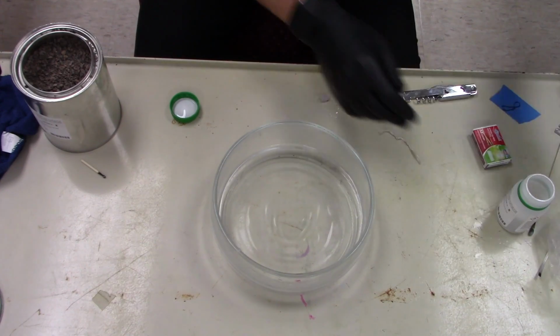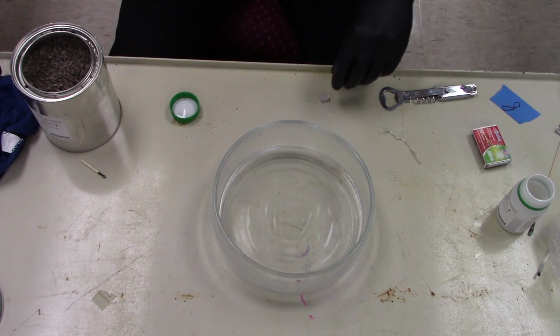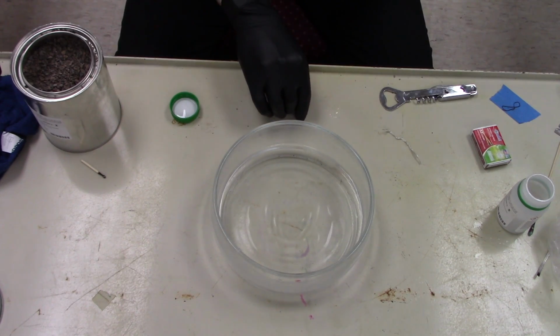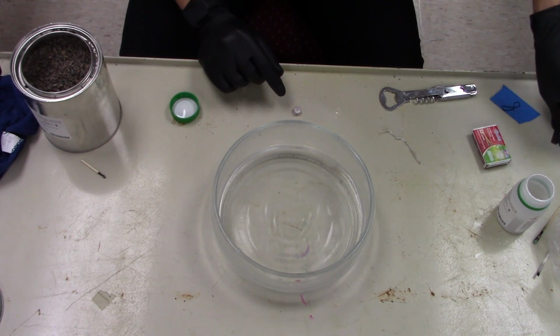So sodium is a metal. If you look all the way at the left side of the periodic table, it's the third one down. So this is it. It kind of looks like a metal, but it's really weird. If I take it and I squeeze it, I have to use two fingers. It's squishy, right? But it's kind of stiff. It's like if you left a gummy bear out for several days and then picked it up. It's kind of like that texture, but it's soft, so I can cut it with a razor blade really easily.